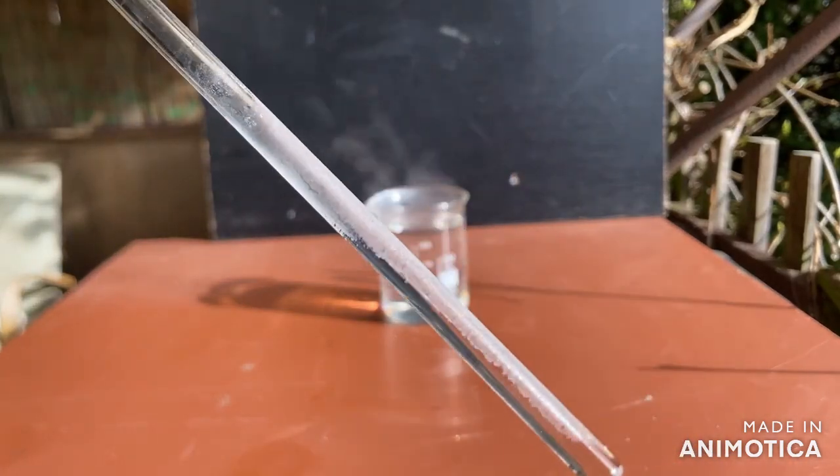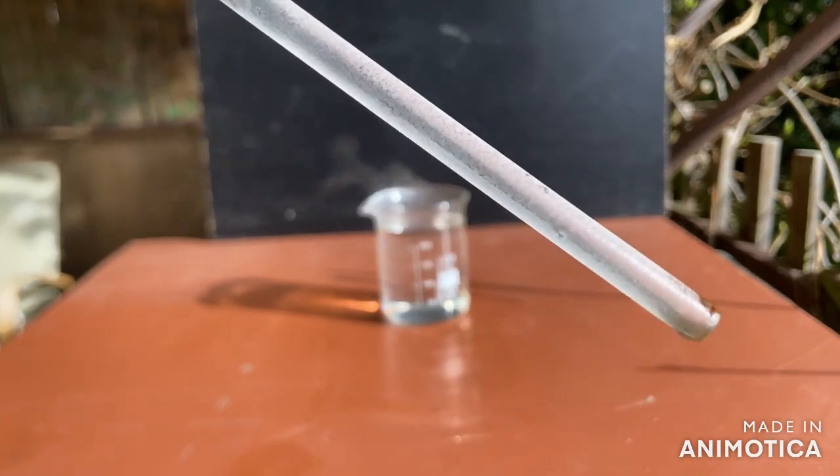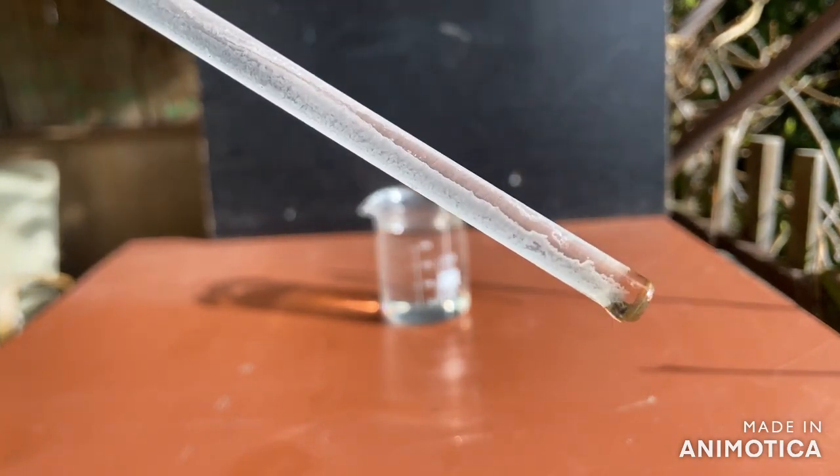As you can see, the solution is so saturated that the ammonium chloride crystallizes on the glass rod.